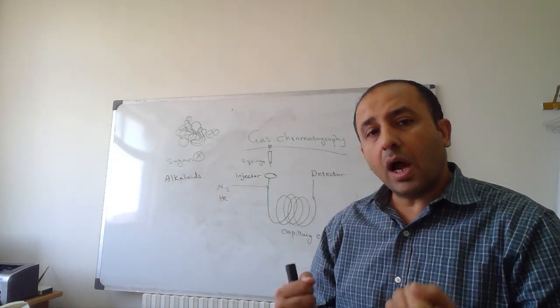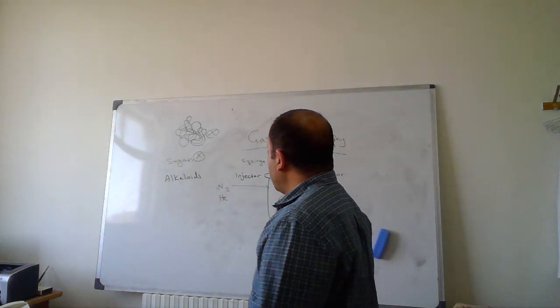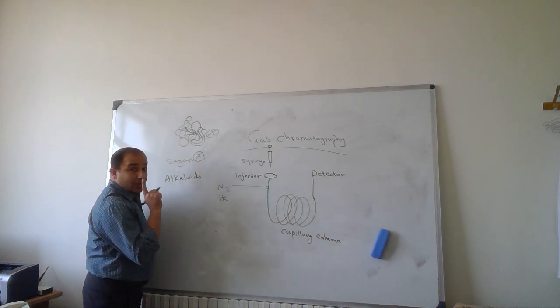Need very high temperature. So you cannot use gas chromatography for ionized alkaloids.